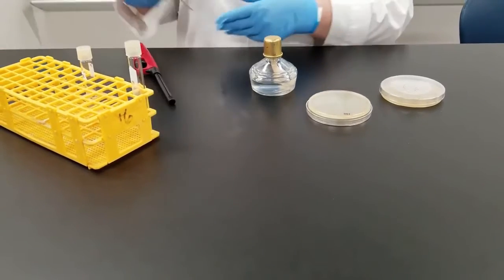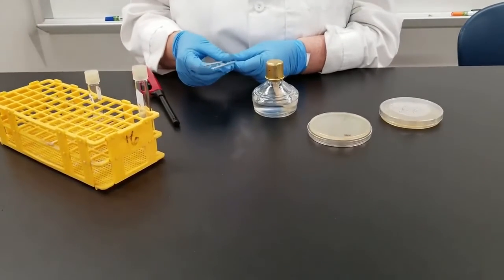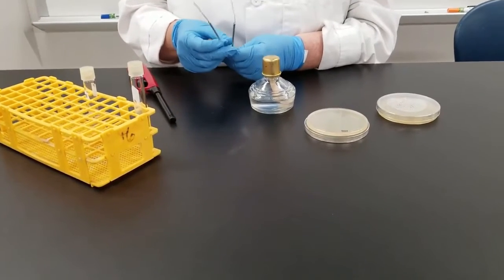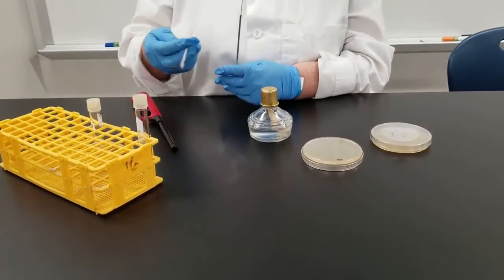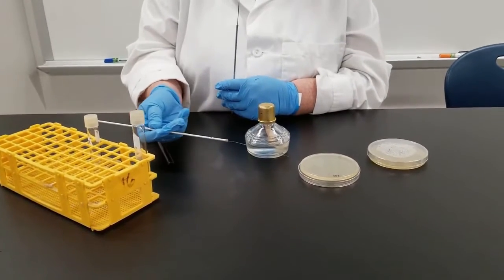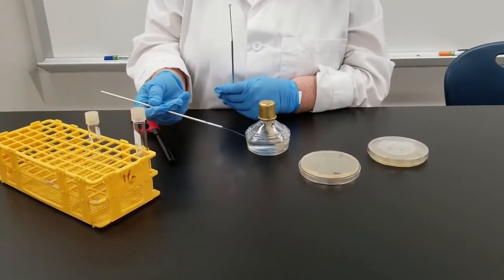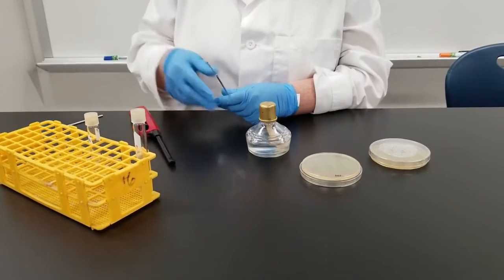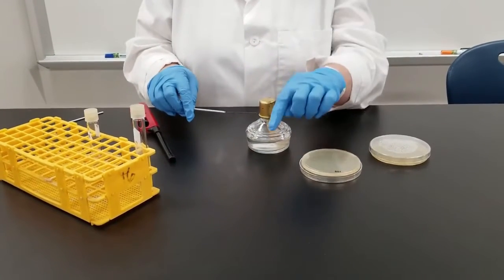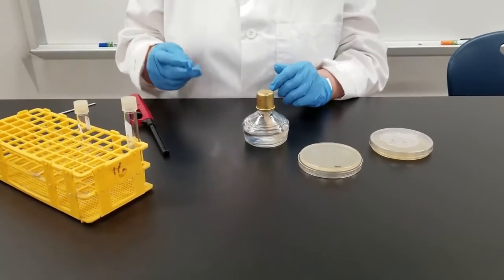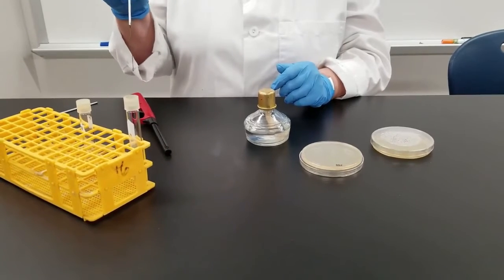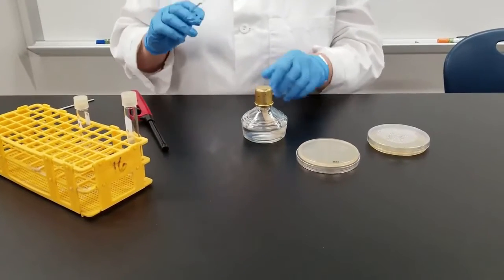Now we also have what we call our inoculating loops and needles. An inoculating needle is just a straight piece here. We don't use that quite as often. The thing we use most often will be the inoculating loop. As you can tell, it has literally a loop at the end, and we'll use this to touch the bacteria in one medium and transfer it to another.